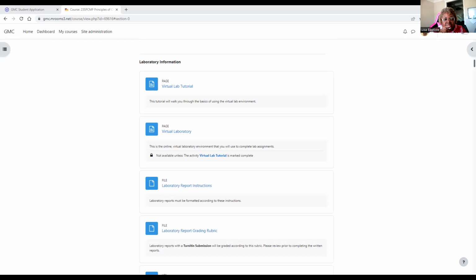So now to find out the volume of the solid we added, we're going to take the 4.83 and we're going to subtract 4.33. And when we do that, we have a volume of 0.50 milliliters. That is the volume of our solid.